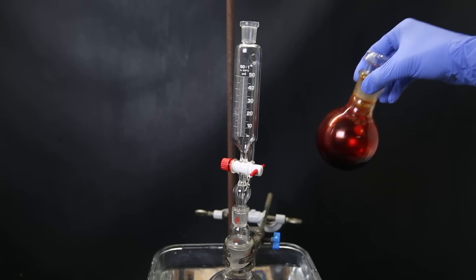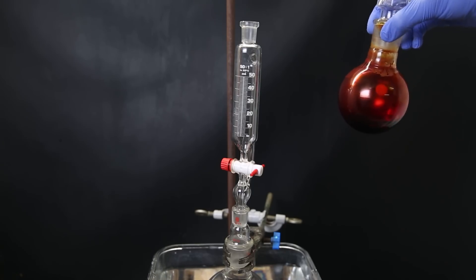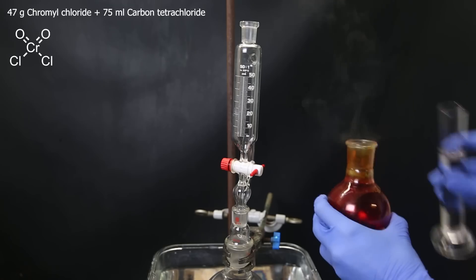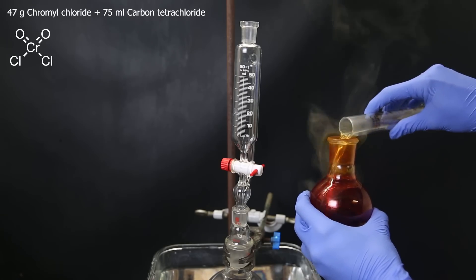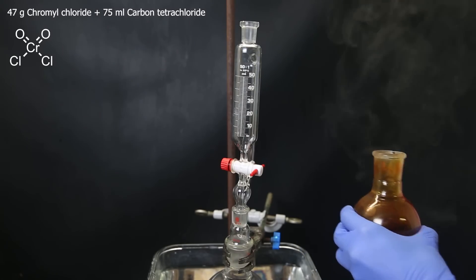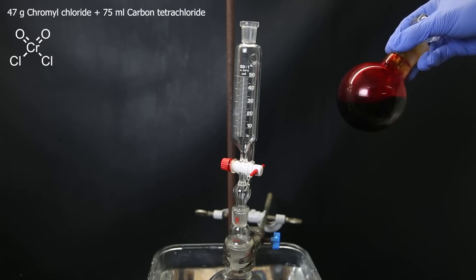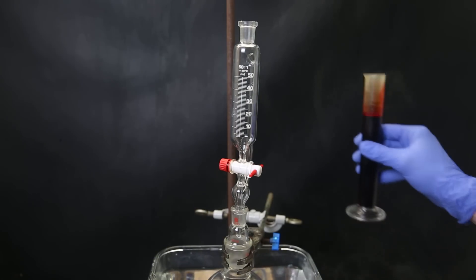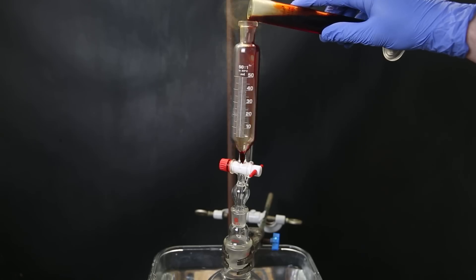Now, I will also dilute the chromochloride with the same solvent to have a tamer reaction. So I just mix 75 mils of carbon tetrachloride directly in the flask with the chromochloride. Since the dropping funnel is too small to hold it all at once, I will add it in two portions. So first, I add about 50 mils of the chromochloride solution to the dropping funnel.